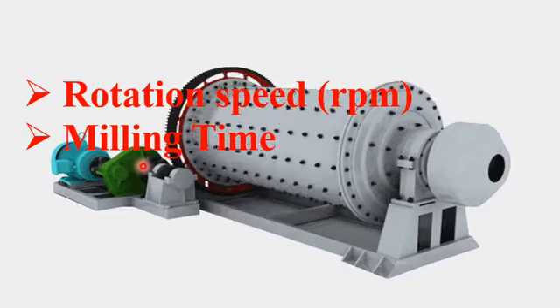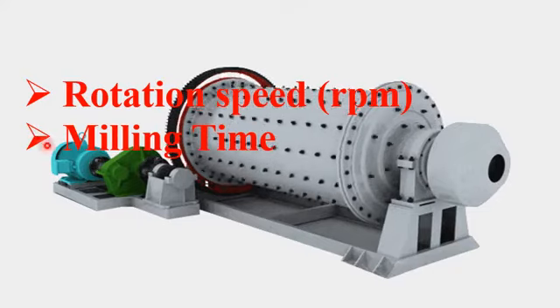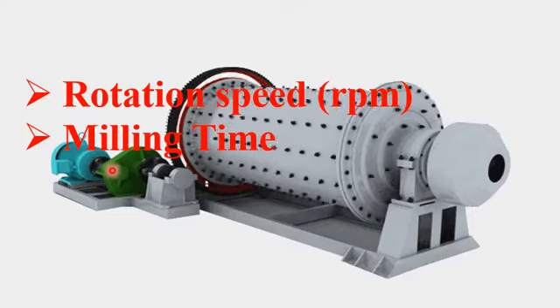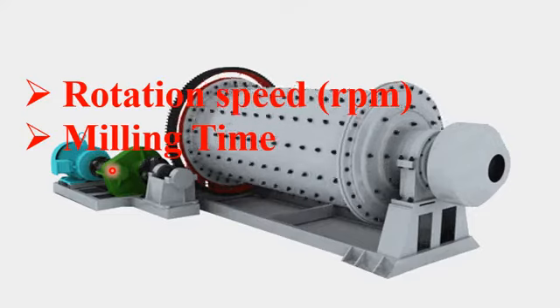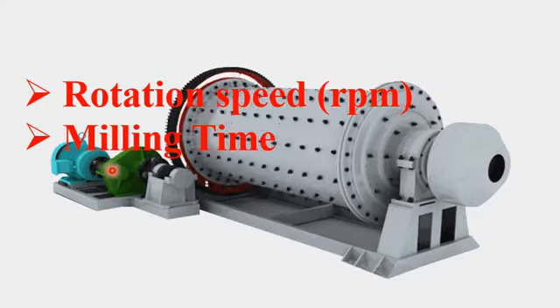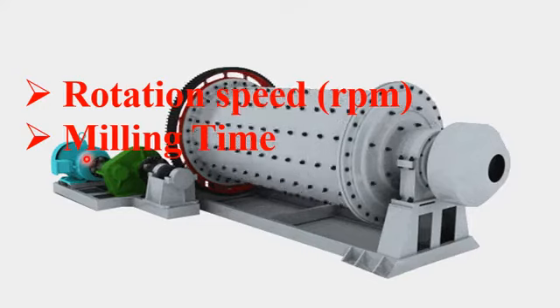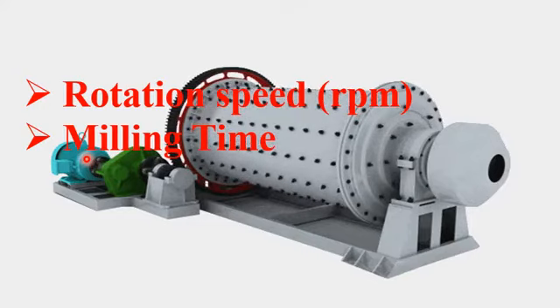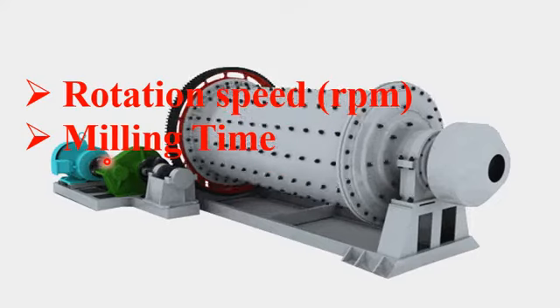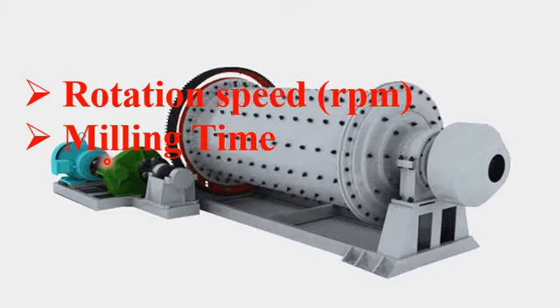Okay. Secondly, if the number of balls is too much, and you increase the milling time, the balls will overlap for a longer time and they will also cause an increase in impurity in the final product. Okay. However, if the balls are fewer, then an increase in milling time will be better in order to get pure fine nanoparticles or nanomaterials.